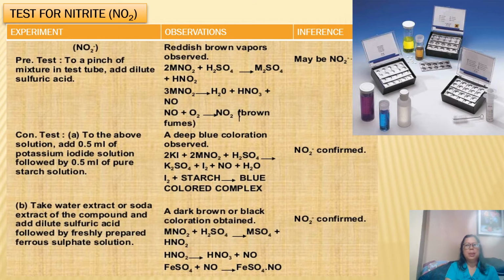In field analysis class, we do not bring test tubes anymore. These are actually vials that could substitute for the test tube. In fact, these are prepared containers for sampling because there are already graduation levels here to say whether the sample contains 2 ml, 5 ml. These are calibrated. Usually, these vials here are calibrated.